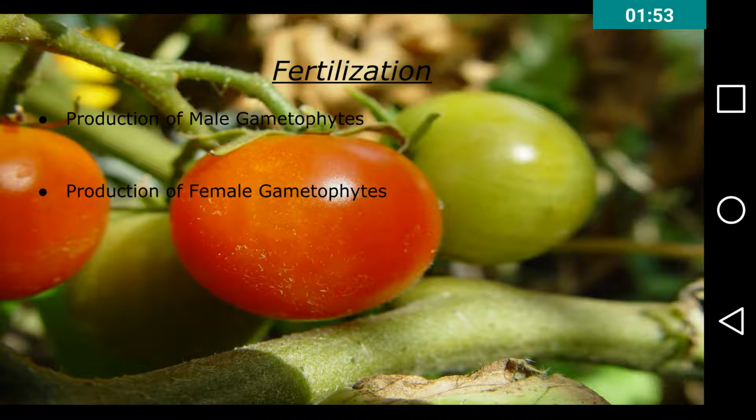Female gametophytes. One female gametophyte can form in each ovule of a flower's ovary. Just like the male gametophyte, a total of 4 spores, being female in this case, are produced through meiosis. However, a lot of flowers tend to lose 3 spores, leaving 1 spore that undergoes mitosis 3 times, making a total of 8 nuclei along with the female spore.